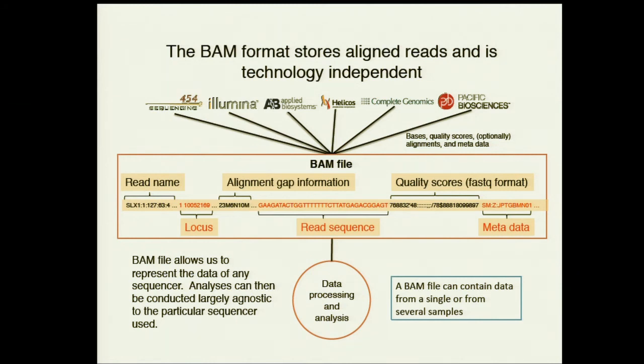And it basically looks like this. You remember that unique identifier for a read? This is a given read in the file. This unique identifier is converted over here. This is the chromosome 1 and position of this first base where it's aligned. So you have this read, and it aligned to chromosome 1 in this position here. And this here is called the cigar string. This kind of dictates how that read is aligned to the genome.